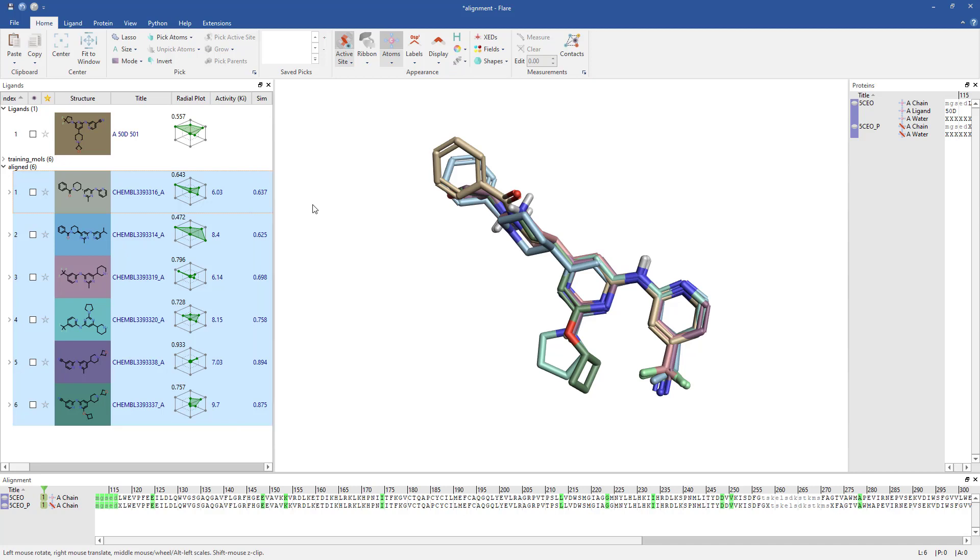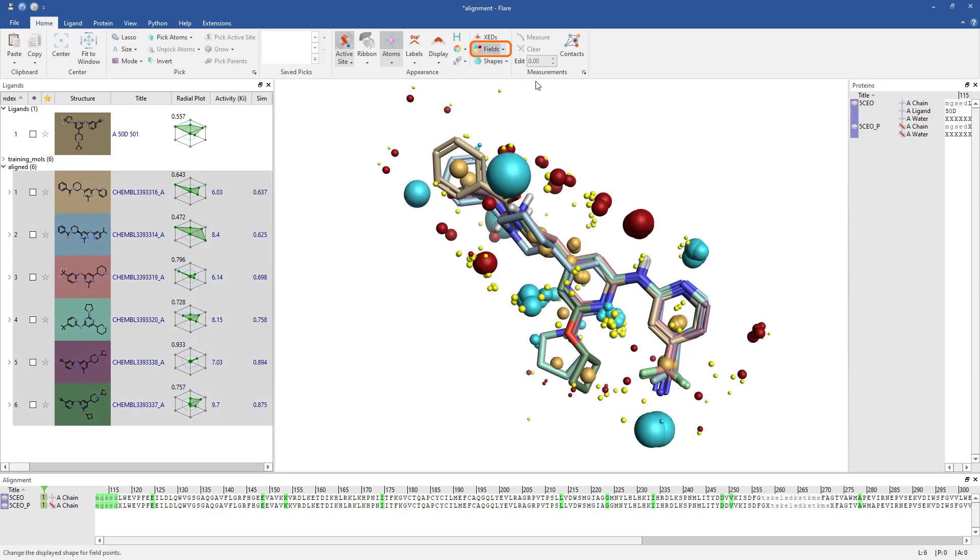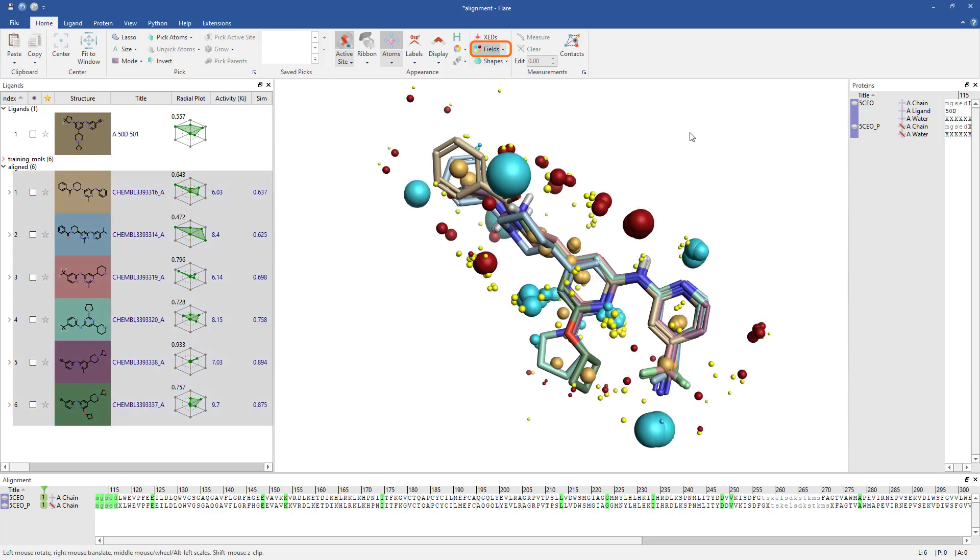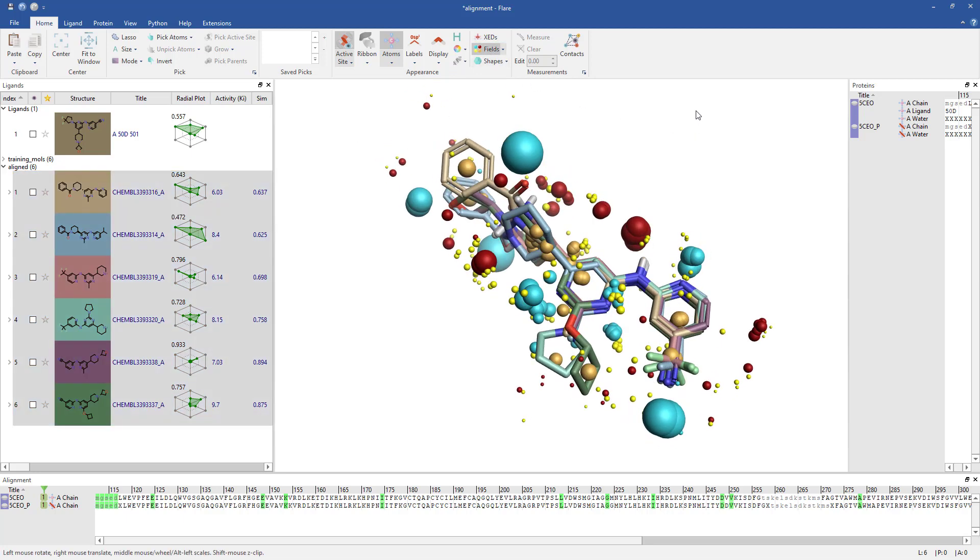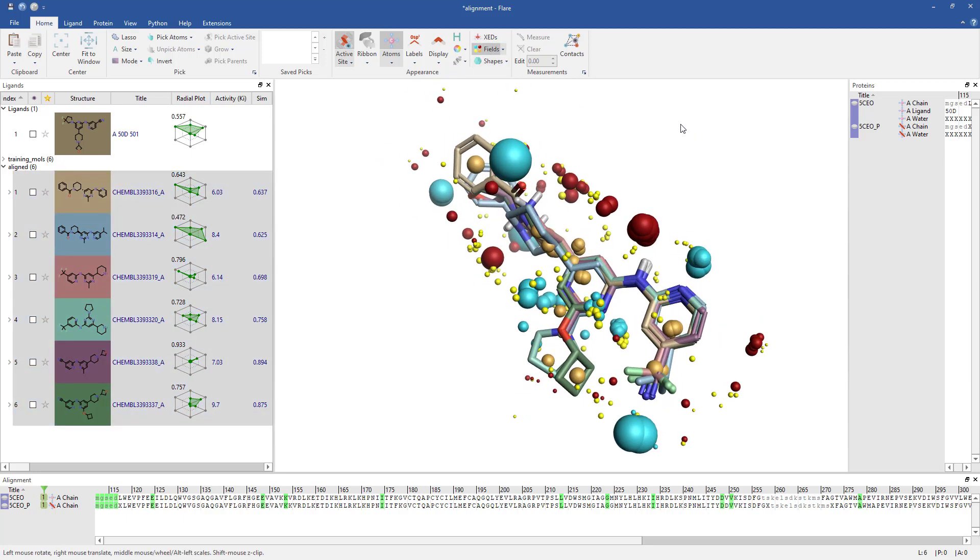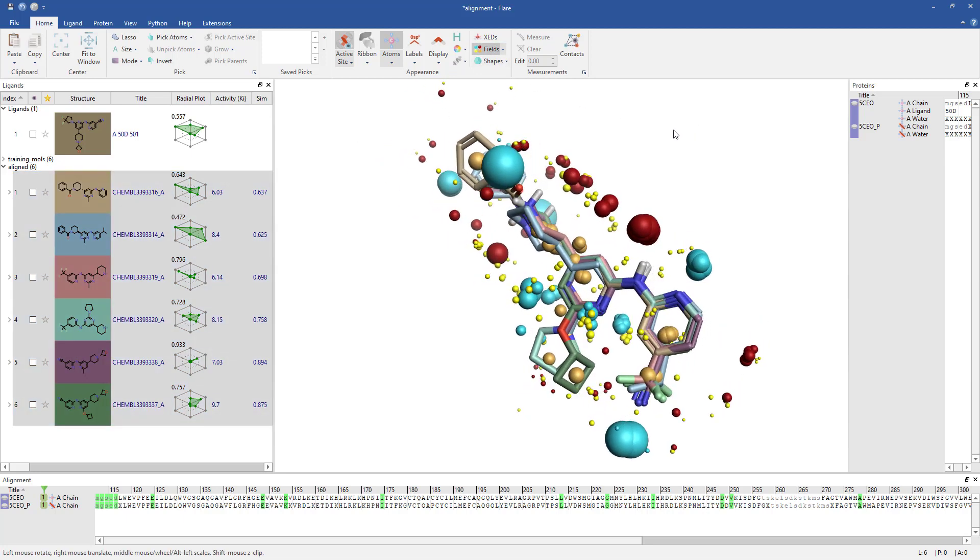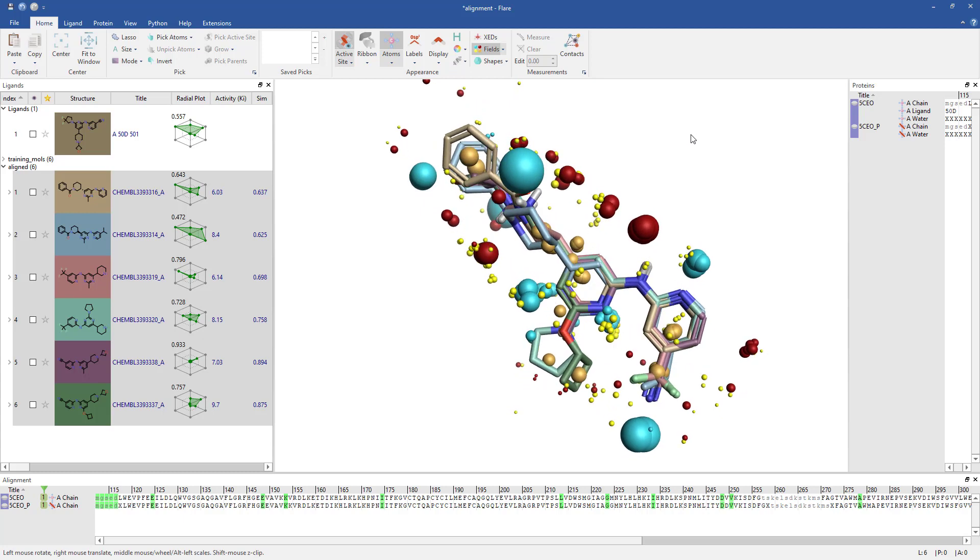If I show the field points using the Fields button in the Home tab, we can see that clusters of positive and negative field points are grouped together, explaining why the molecules have been aligned in the way that they have.